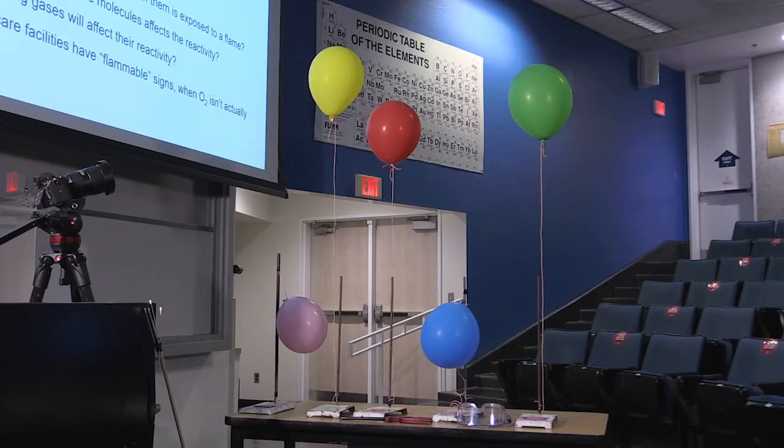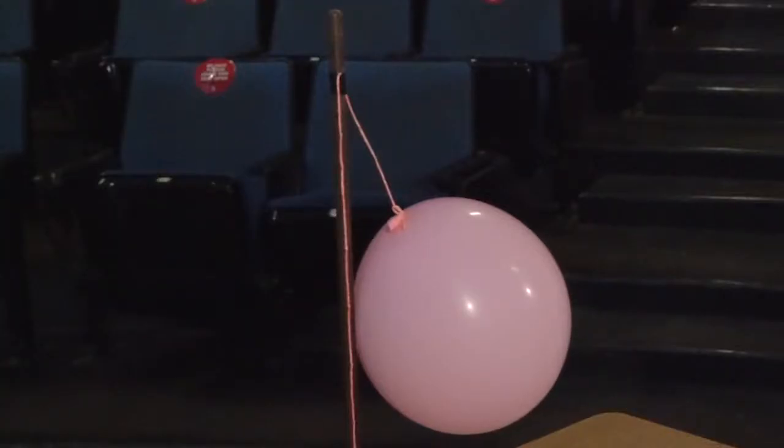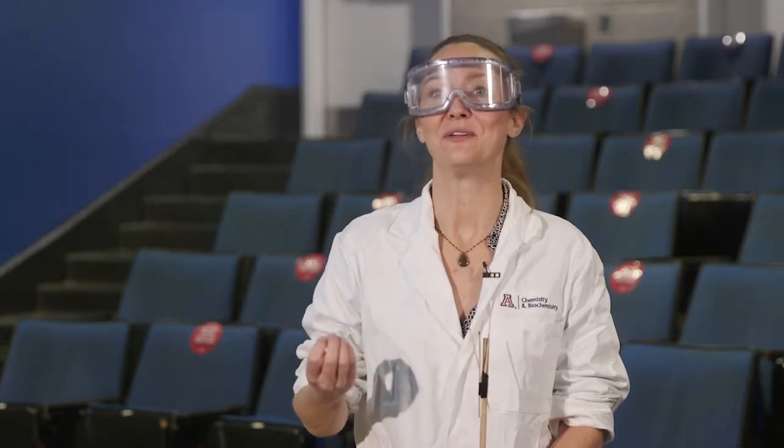You'll notice, of course, that the helium balloon was pulling toward the ceiling, and our first balloon, the nitrogen, was down on the table. Why is that? It's not about the number of molecules or atoms in the balloon. It turns out that it's about the molar mass of each of those gases. So the density of gases is actually what affects whether or not they float or sink. It's the relative density to the mixture of normal air.